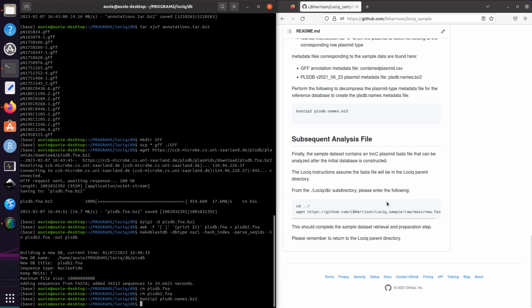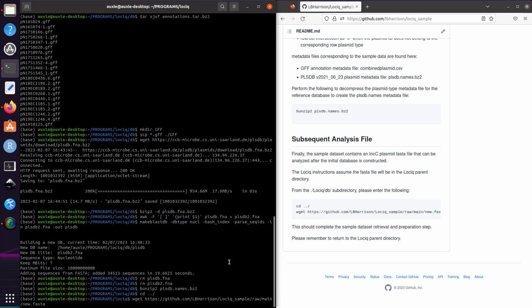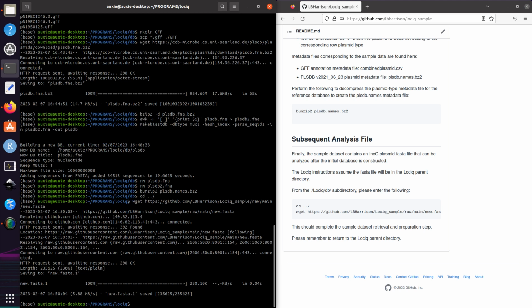And then finally, if you choose to use the demo to analyze new files, we're going to download a separate file that you can use for analysis after you create the database. That corresponds to step 6 in the process, so you won't have to worry about that right now. But if you have everything set up the way it needs to be, and you followed the text boxes in order, then you should be good to go.